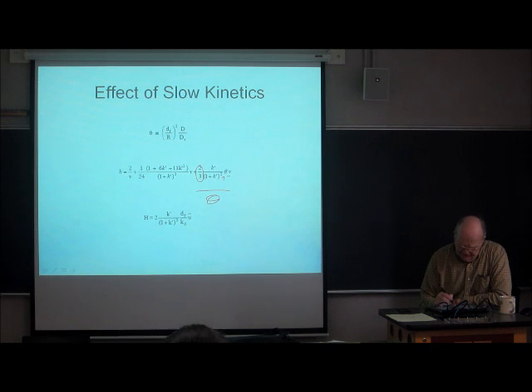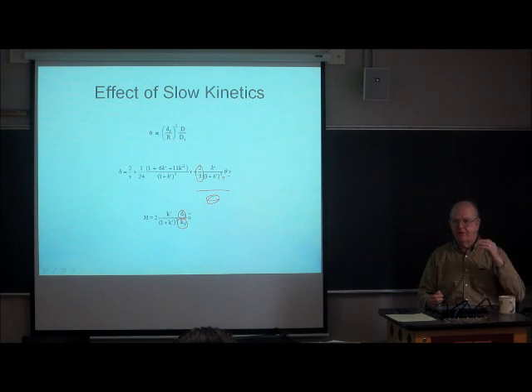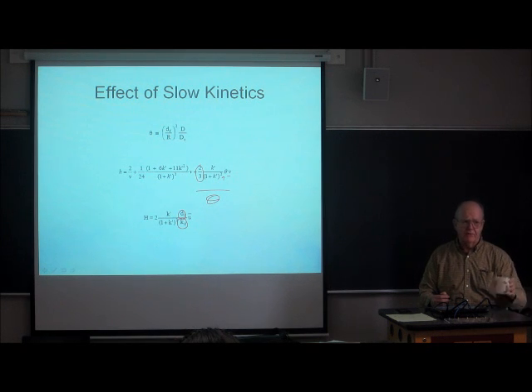And the slow interfacial kinetic effect depends upon the film thickness and the rate constant for crossing that interfacial barrier. That's a chemical rate constant now. You can't really predict what it is. It depends on exactly what the solute is, what the stationary phase is, and the temperature. So I can't do any more with it than this. I can't predict it. But you're only going to see this contribute to the HETP when you've got very thin films.